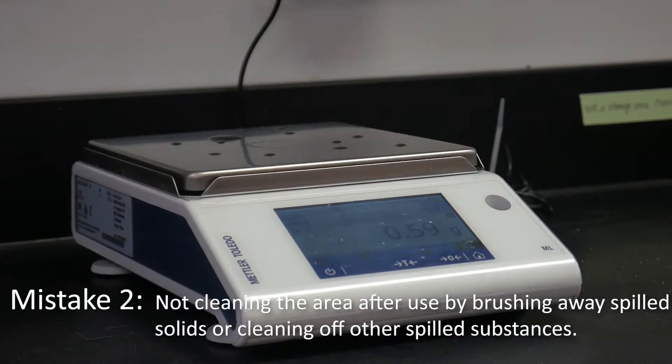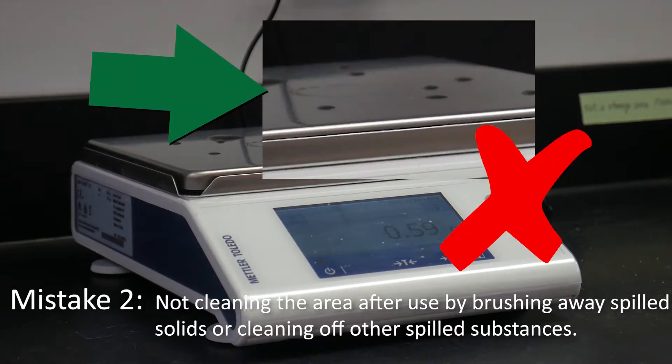Mistake 2: Not cleaning the area after use by brushing away spilled solids or cleaning off other spilled substances.